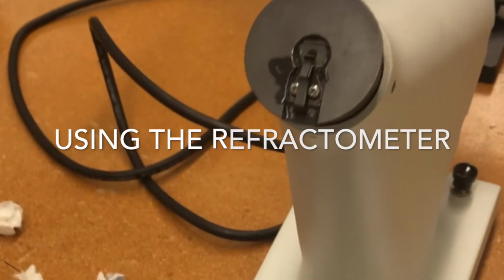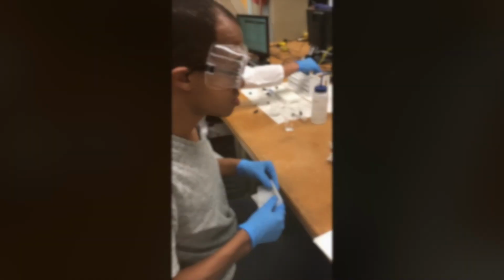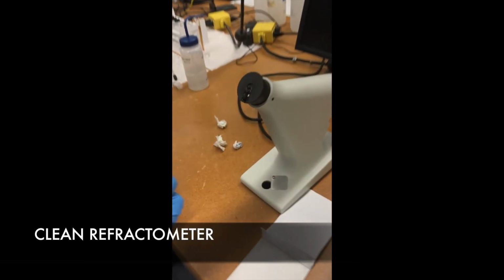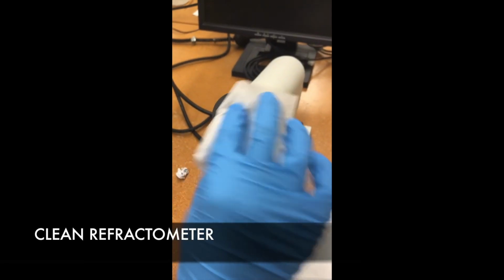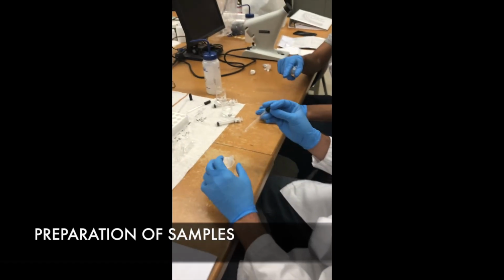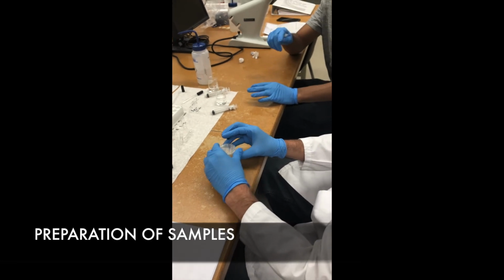Now we have our refractometer, which we'll use to measure the refractive index of the samples to determine the ethanol concentration of a sample. Before using it, it is important to clean the refractometer using a Chemwipe. Here we have the preparation of the samples before they are put into the refractometer to be analyzed.